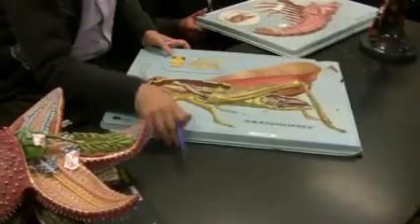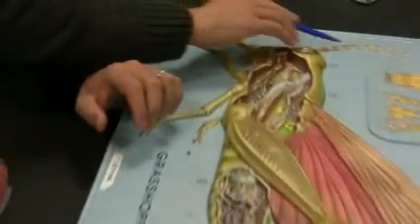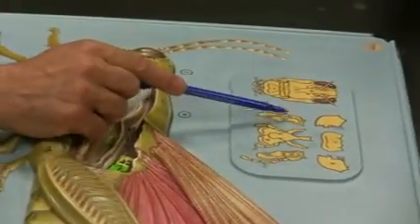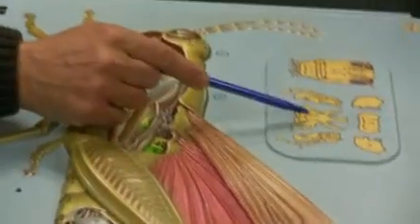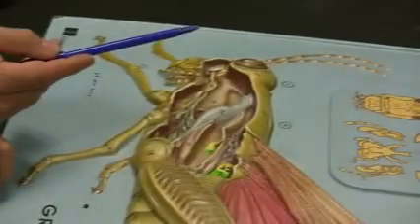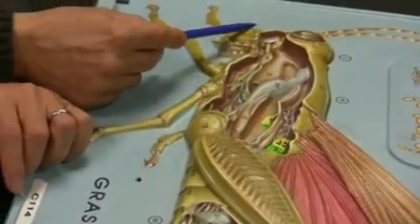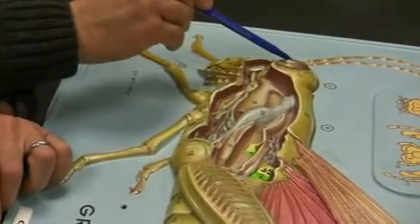Grasshopper. Again, let's do this grasshopper. So since we're in grasshopper. Compound eye, antenna. The mouth part, we went over that. Mandible, maxilla, mandible, labium, labrum, or the other way around. Please make sure you look it up. Again, these are all of the mouth parts. Compound eye, simple eye up in the front.